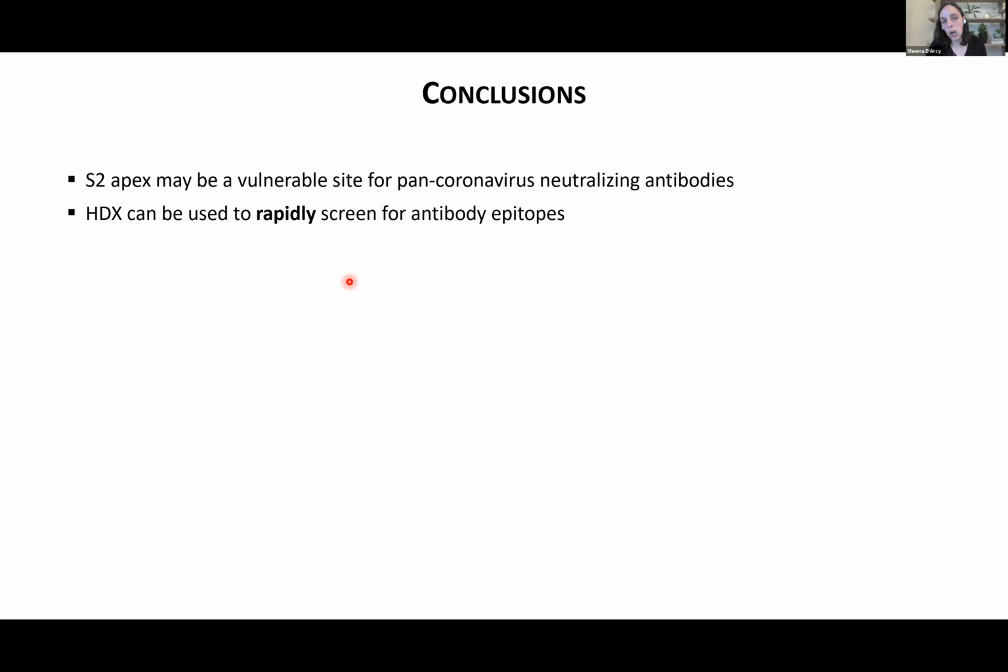And I'll just jump in here on the written question and answer. Someone's asked if these extra processing steps are online or offline. I will say they can be either. If they are automated, there's always an advantage for reproducibility. We do our ion exchange offline, but the basic step of protease digestion, that's one that we always do online. We always try to keep it online because it's really important to be reproducible, but you can do either of them, depending on your specific system.